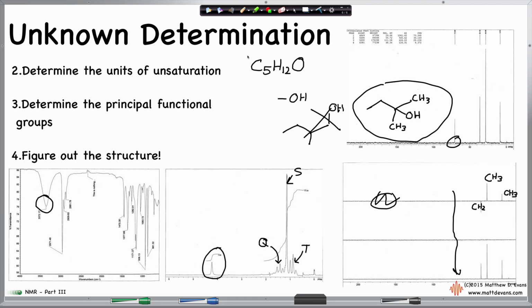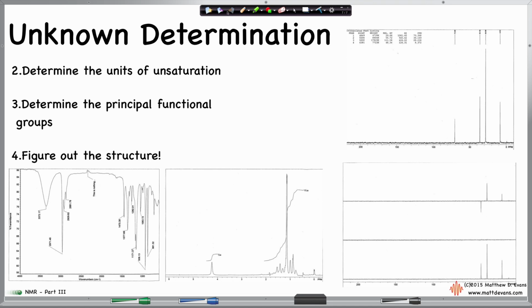I'm going to go ahead and clean the whole slate. The last thing that I want you to do on laboratory experiments, but also then the exam, is to do what's known as peak assignments. So what you're going to do is draw the structure again on each spectrum, and I want you to draw an arrow from each type of hydrogen to which signal it represents in the NMR spectrum, but also the carbon spectrum. So for this OH, that's that signal.